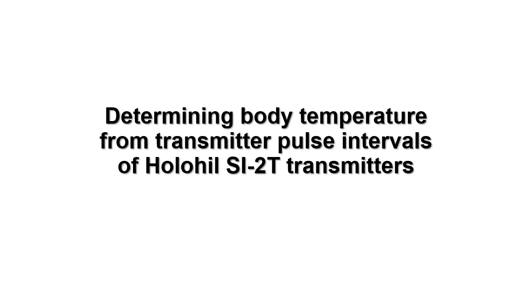This is a quick explanation of how to convert the transmitter pulse interval to temperature using Holohil SI-2T transmitters and the temperature charts furnished by Holohil.